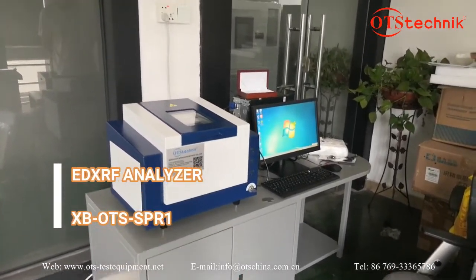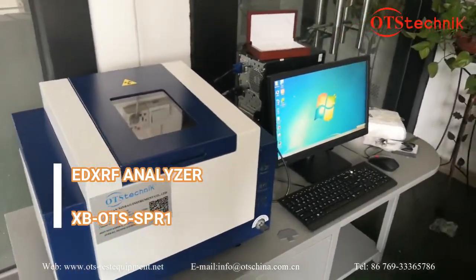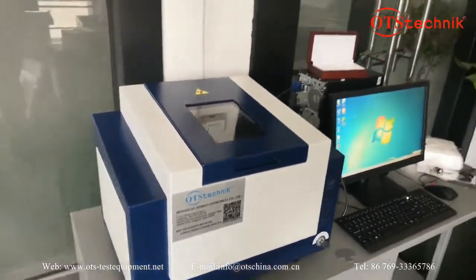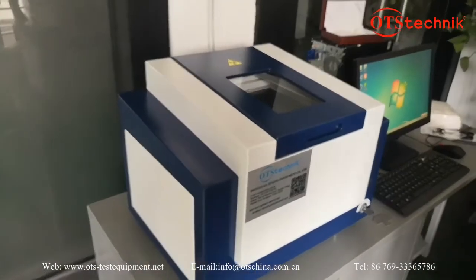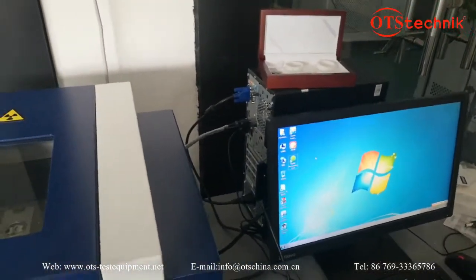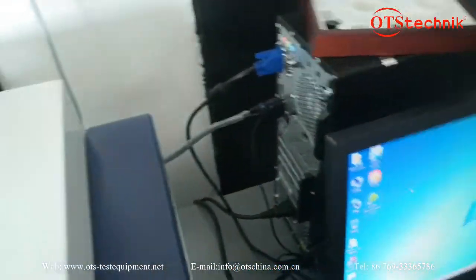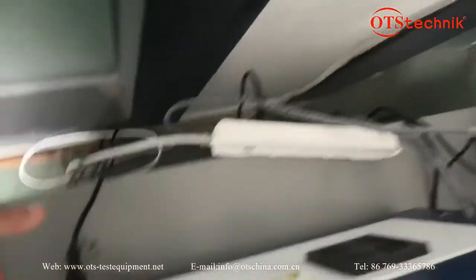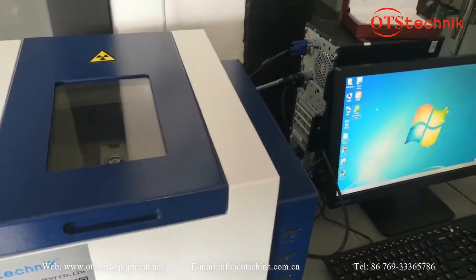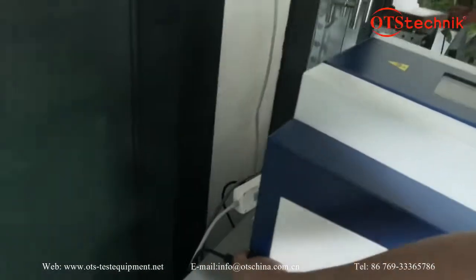Welcome to OTS. This is the X-ray machine. Now let's talk about how to install and operate this machine. First, we have to connect the power and the computer with the connector to the machine. Now the installation is finished. Let's talk about how to operate.